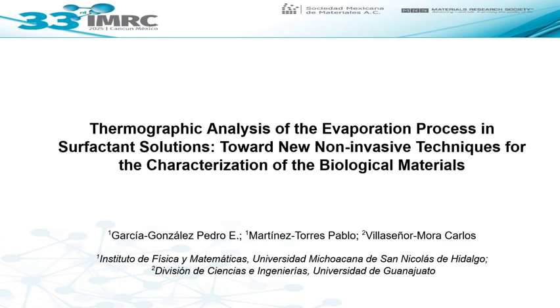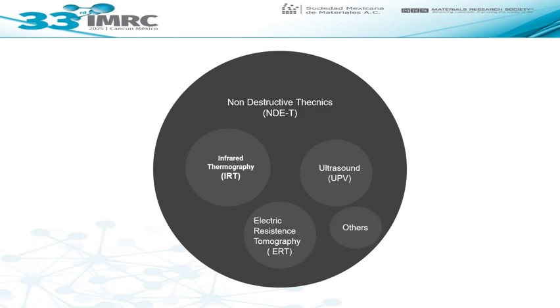Well, to start, it must be said that infrared thermography, or IRT, is a non-destructive technique. This means that the technique doesn't have to destroy a sample to extract its characterization. Other examples are ultrasonic or electroresistance tomography, among many other techniques.